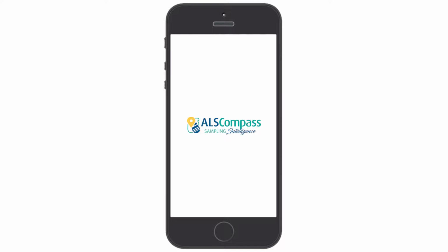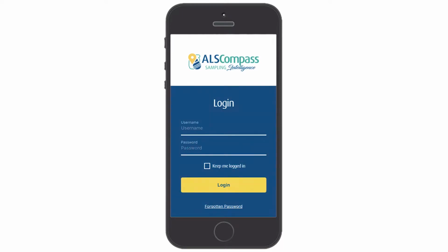In this tutorial, you will learn what each menu item in the ALS Compass app does and how it can streamline your sampling process. Upon opening the app, you'll be asked to log in. Enter your email address and password.